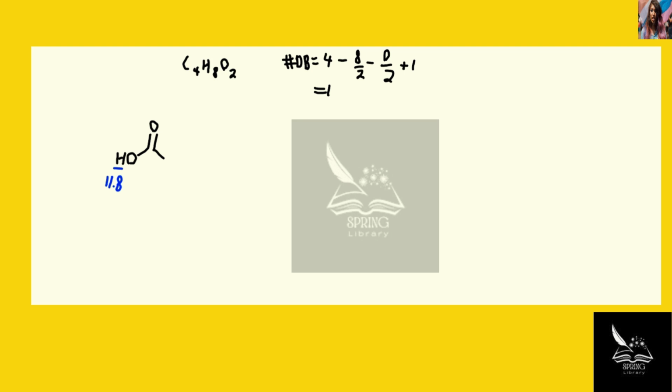Now we have this 1 carbon here, and there should be a 2nd carbon here, and then let's draw the other 2 carbons to satisfy the molecular formula. We'll just draw straight chains and see if this is true. So let's now work on the most shielded proton.